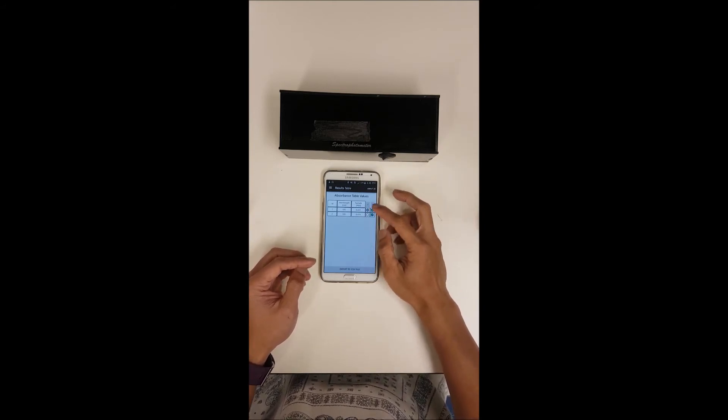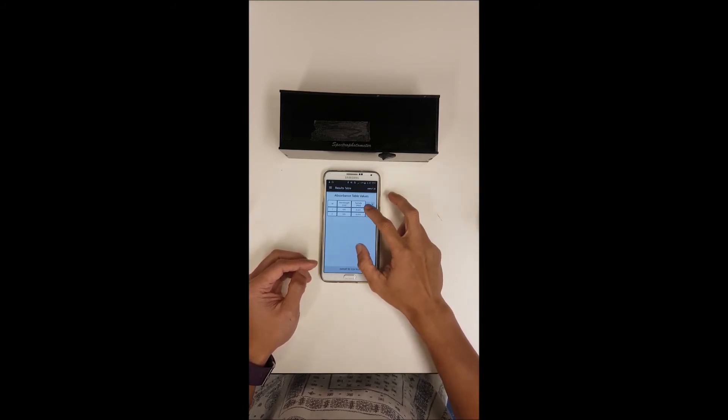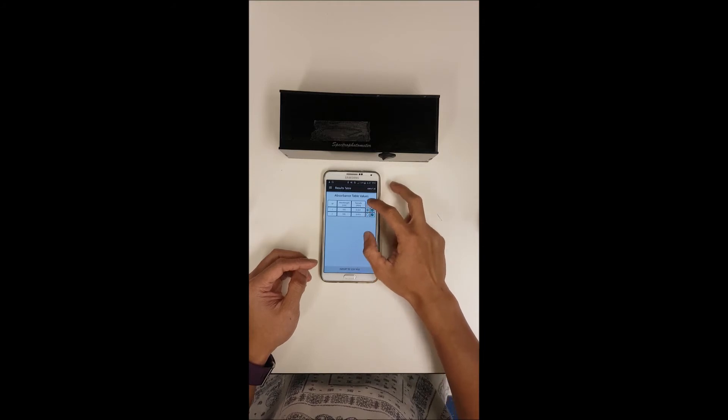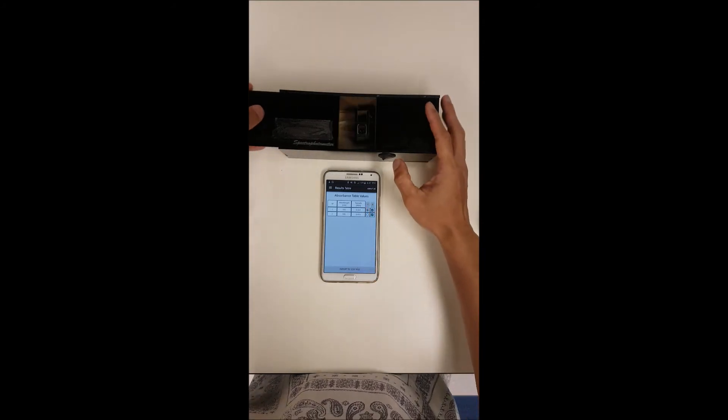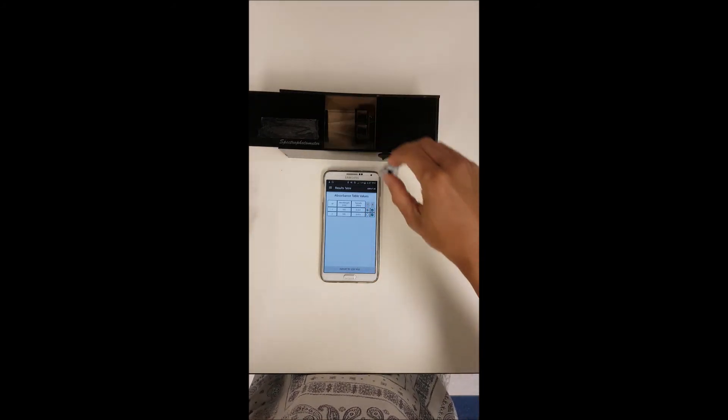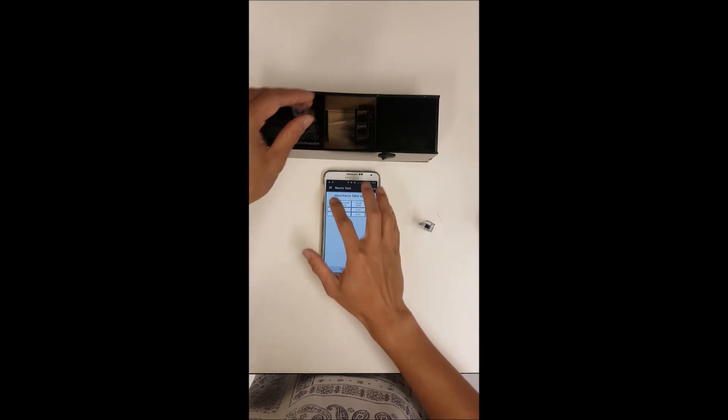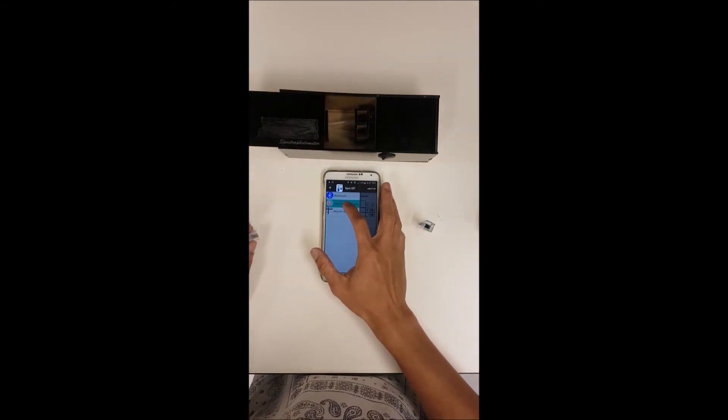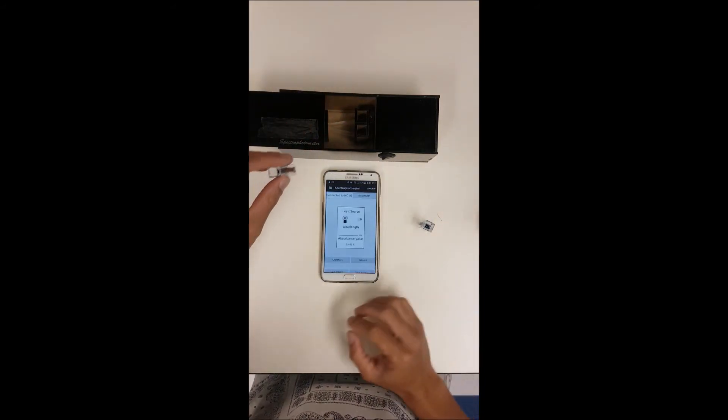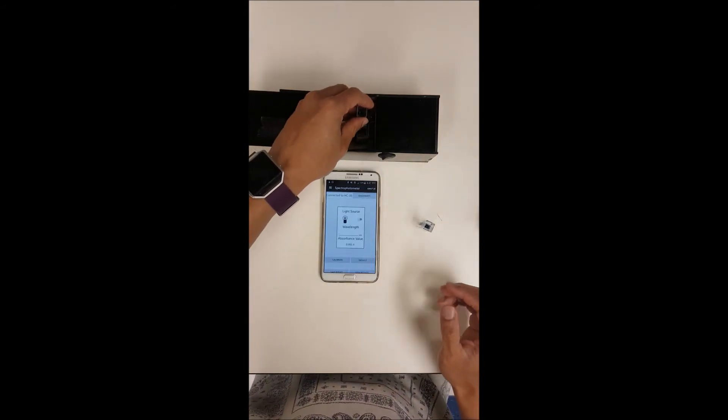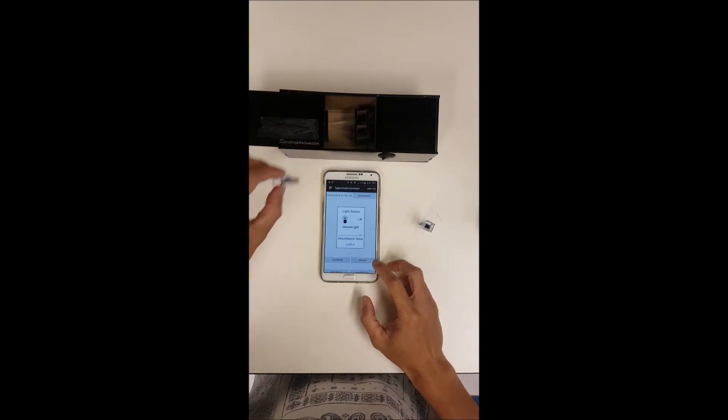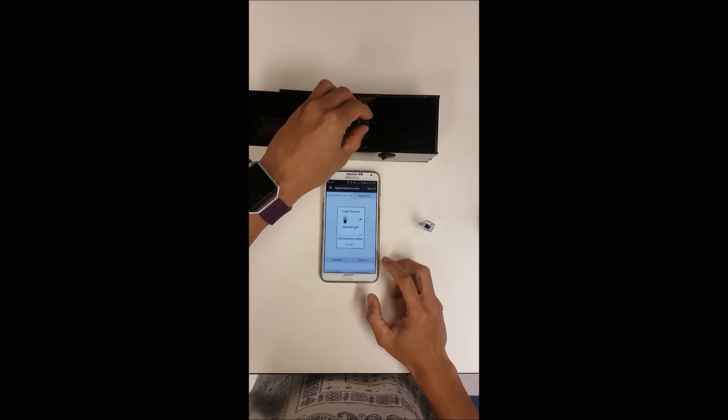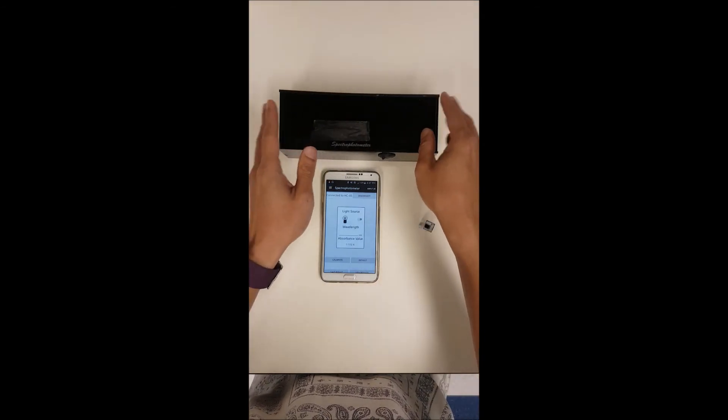This would be the blank. Let's say you have done it without the blank in the first place. We can always go back by clicking spectrophotometer and here you can always generate more readings if you wish to.